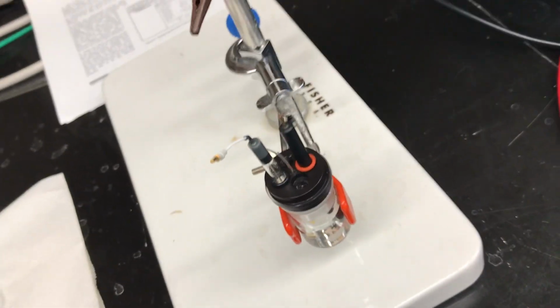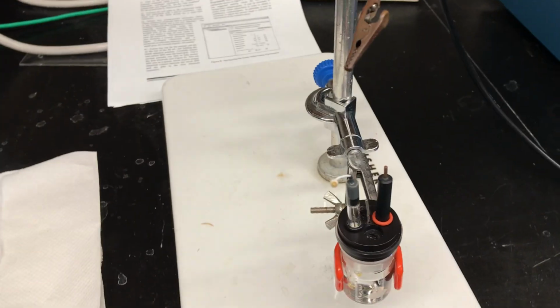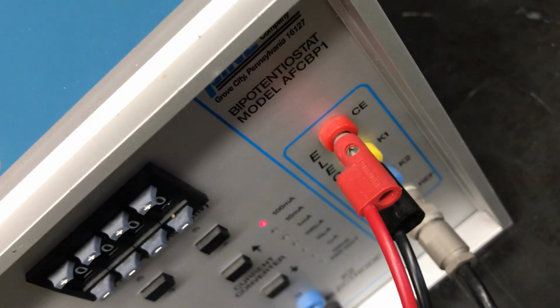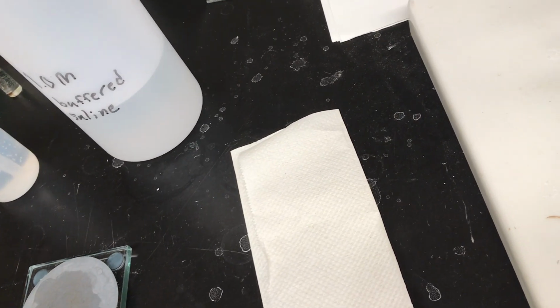All right, now the next thing that we need to do is make connections between the potentiostat and the electrochemical cell. Okay, so we have 3 connectors here. One's up here at the top, and then 2 are down here. And we can track those back to the electrode connections here on the potentiostat. Now the CE, which is the red cable, CE stands for counter electrode. So I'm going to attach that in here to the platinum rod. Okay, so you can see it attached to the platinum rod there.